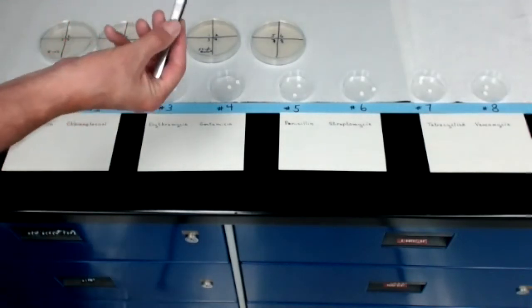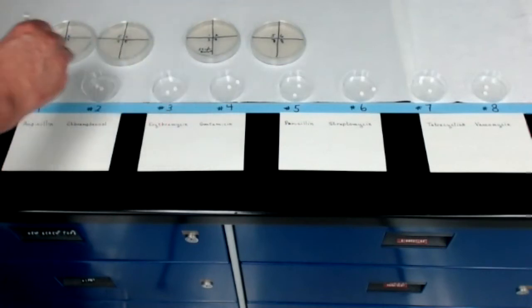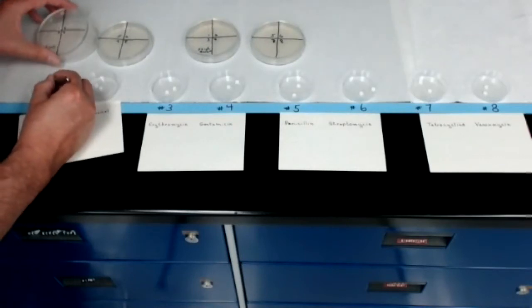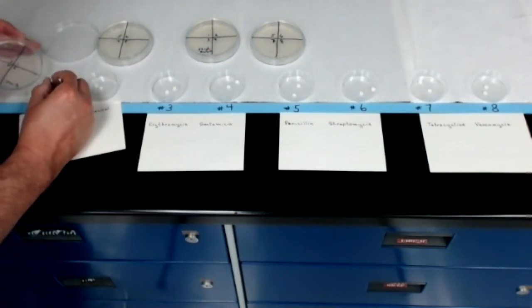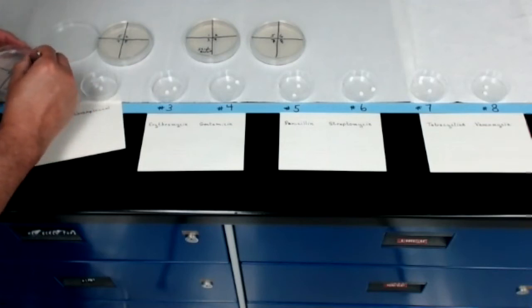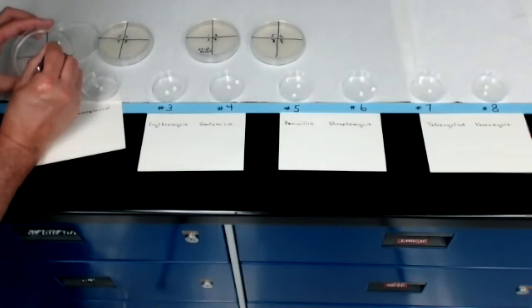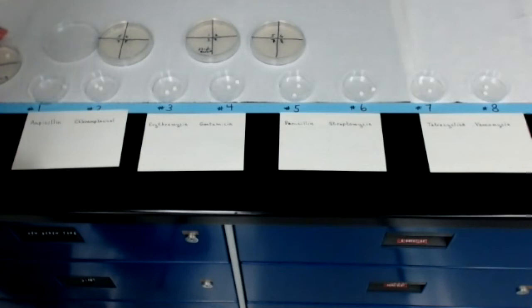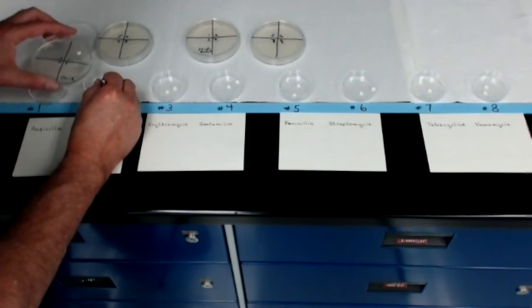So I have forceps here. The tips of these forceps have already been sterilized. These discs, of course, are sterile. Getting the disc is going to be a little tricky. So I'm going to take this ampicillin disc and put it in quadrant number 1 of the first E. coli plate. And hopefully you'll notice that I gently push down on that disc to make sure it's sticking to the agar surface. I'm now going to take a paper disc from the chloramphenicol dish, and I will put that on the number 2 quadrant of the E. coli plate.